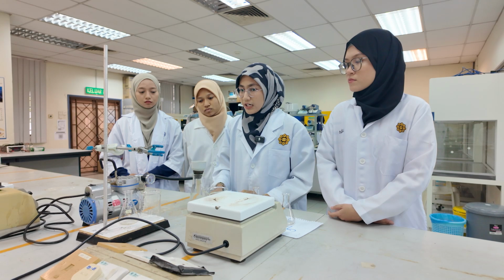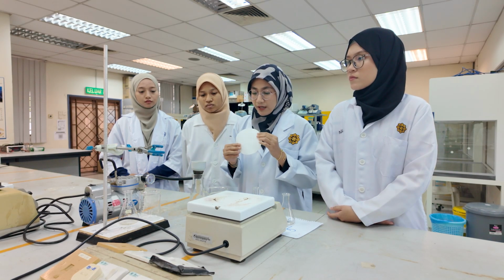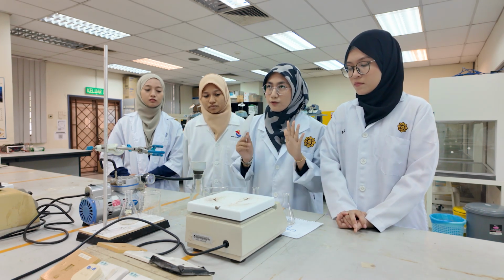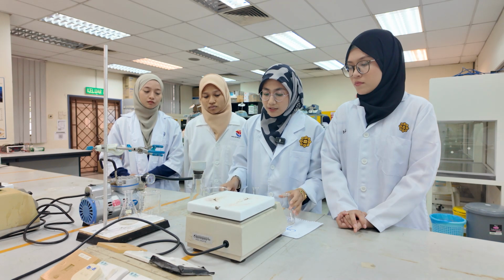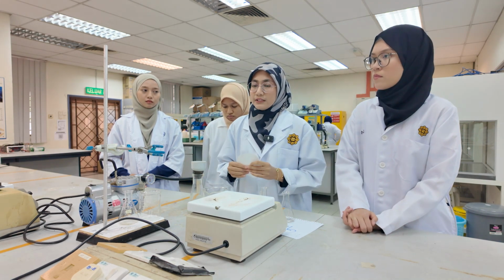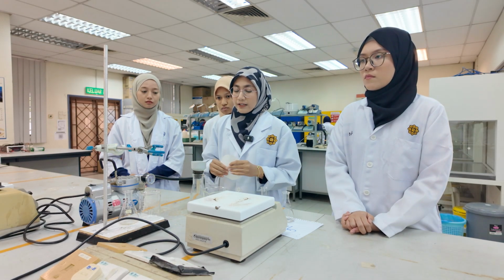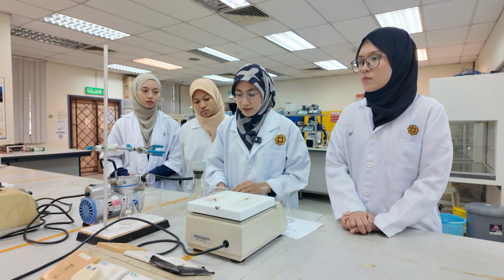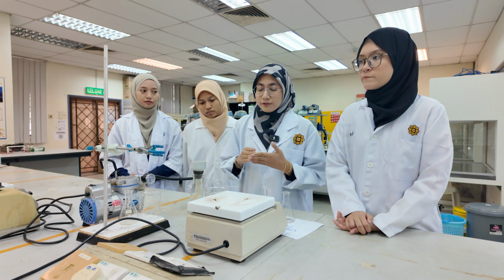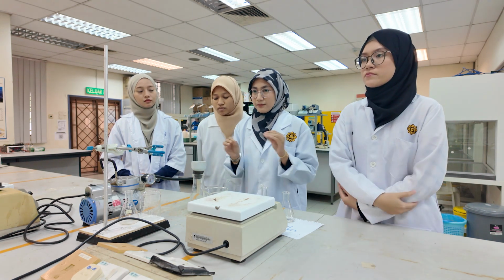So you will see the crystal will occur on this filter paper, but you will see the difference between these two solvents. Because the rate of crystallization depends on the rate of cooling. If cooling is very fast, the atoms don't have time to rearrange themselves. But for crystals that cool slowly, they have time to rearrange themselves. So it will look different between those.